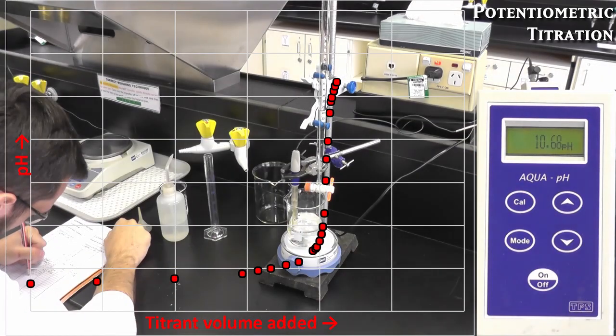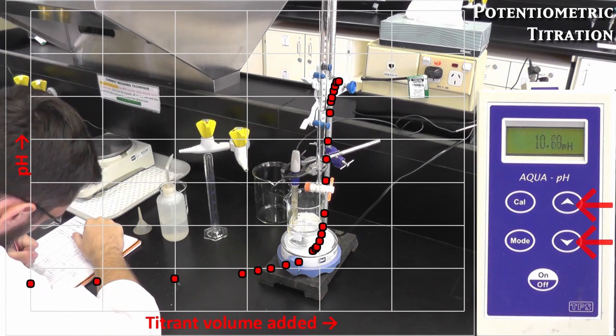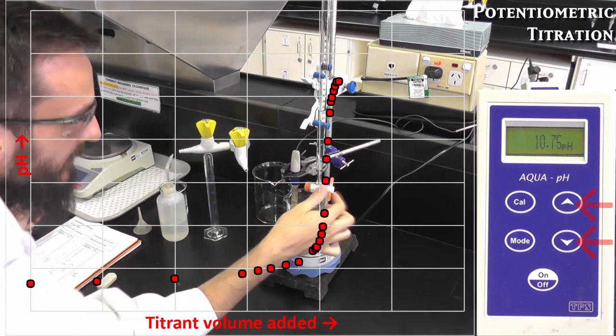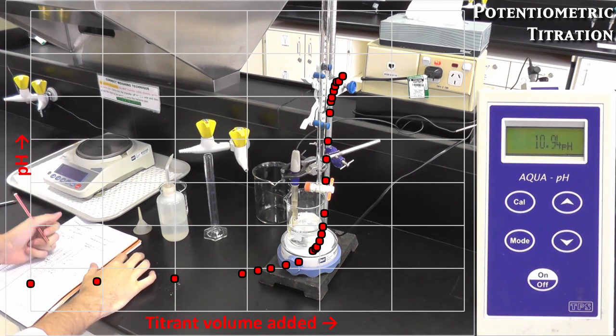As a quick note, the pH meters will shut off to conserve batteries. When they start to beep, you can press the up or down arrow to keep them on. If they do turn off, simply hit the on-off button again and resume measurements. There's no need to recalibrate.